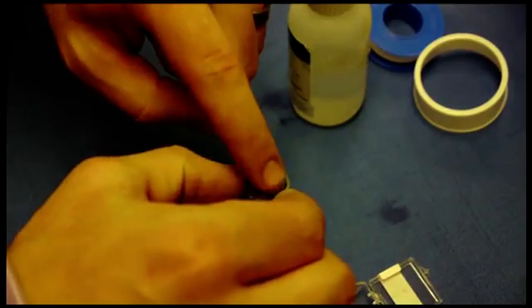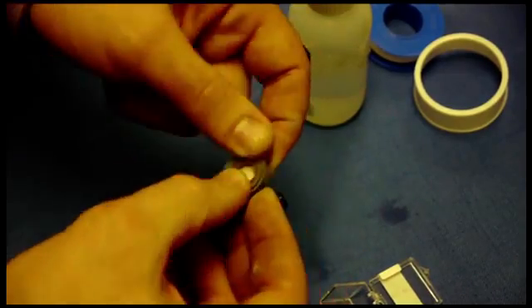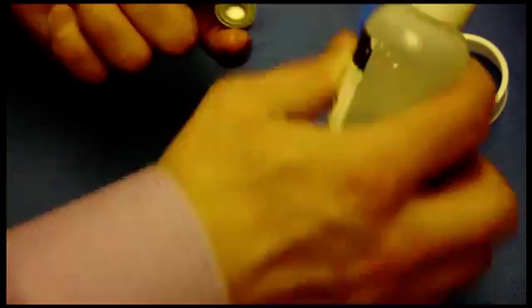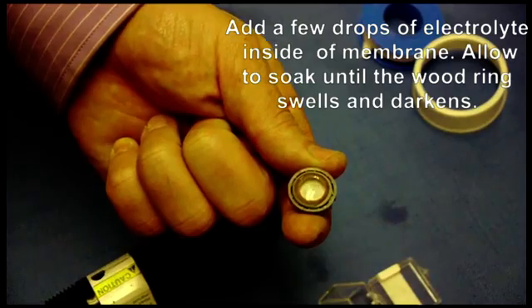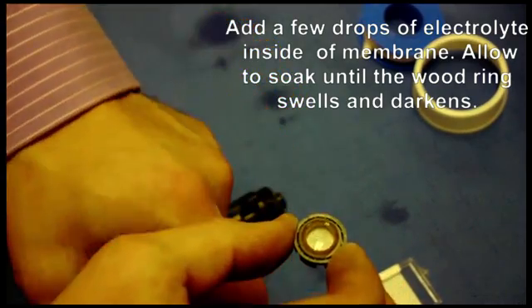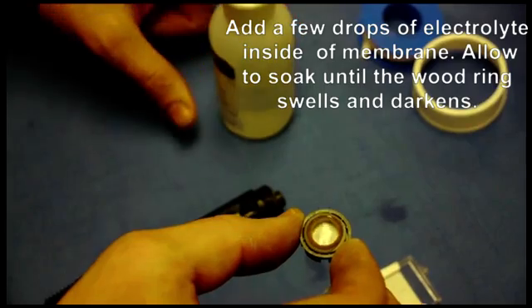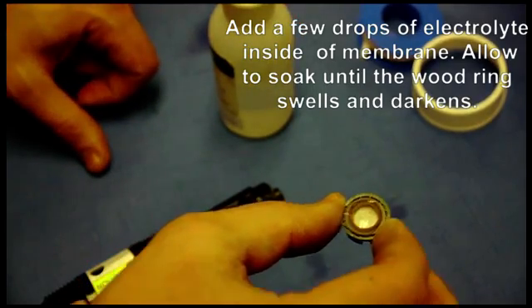What you want to do is place the wood ring into the membrane assembly and then fill it up with your electrolyte solution. Put it cup facing up, fill the solution all the way to the brim, and then set it aside and let the wood ring absorb the electrolyte solution.